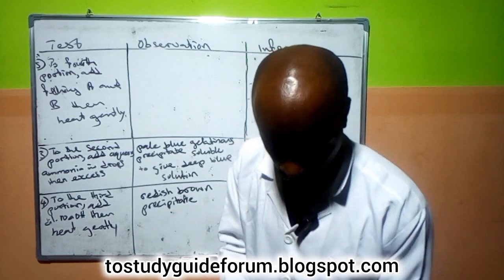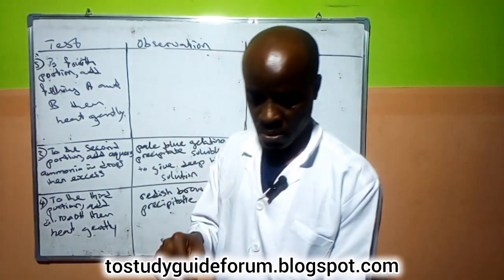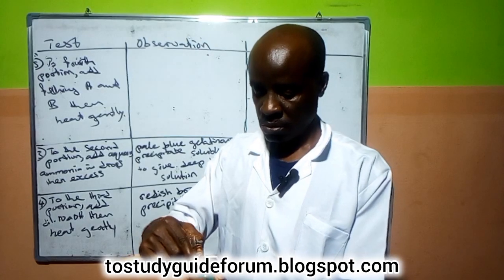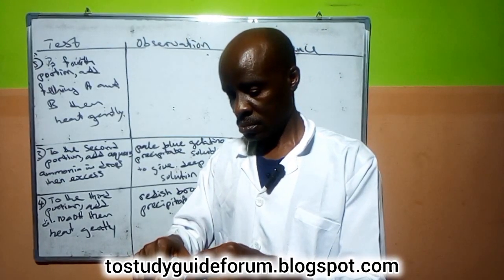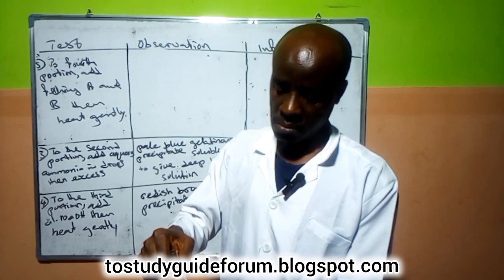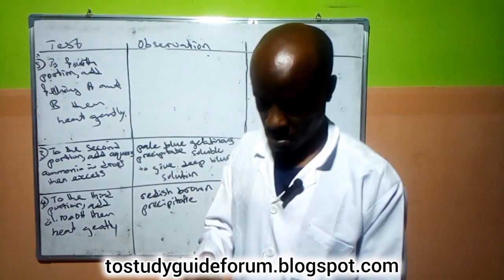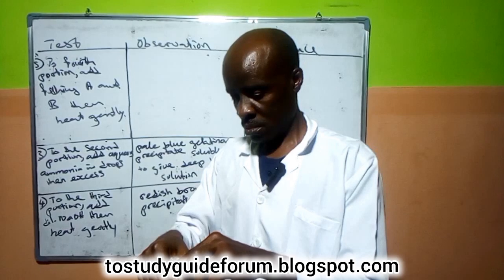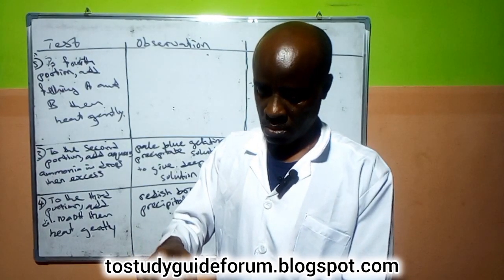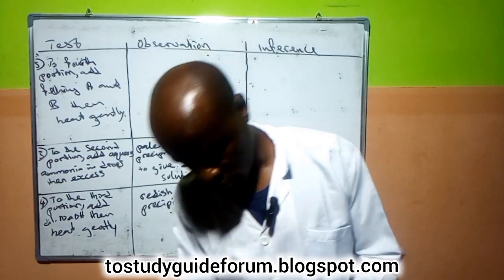Okay, let me start with Fehling. So we are going to heat them again.